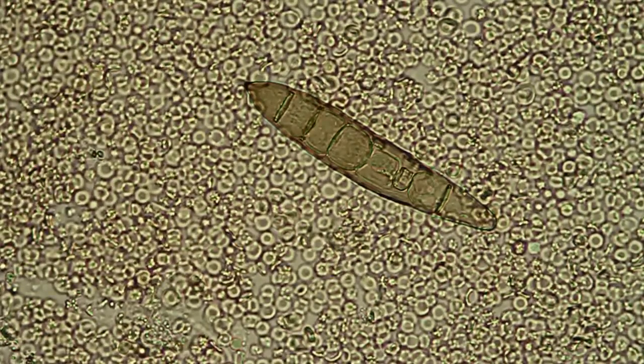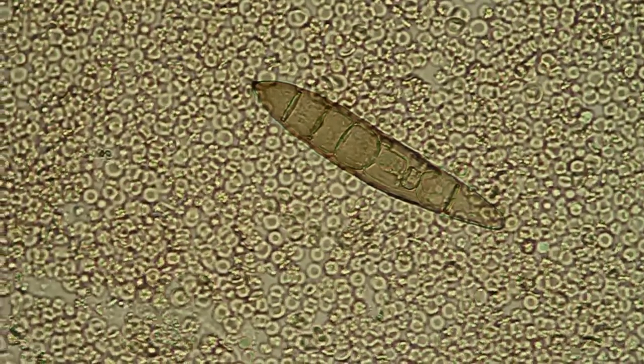I've noticed that these blood cells here have spikes on them like pollen. They seem to be rounding off more now as it ages, but when they were fresh each one of them had spikes, each blood cell was surrounded by spikes. You can still see some of them there.